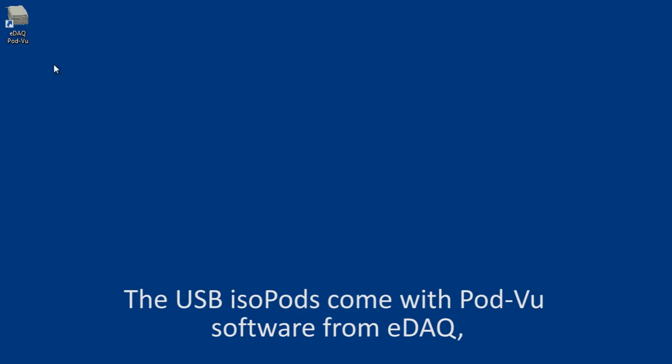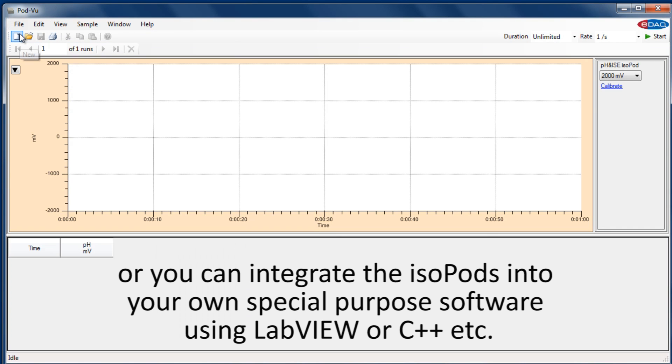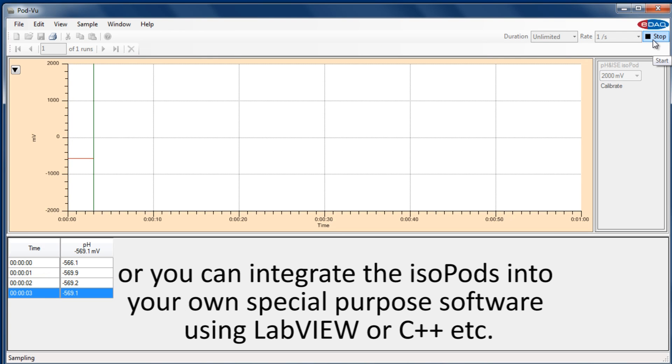USB isopods come with Pod View software from EDAC, or you can integrate the isopods into your own special purpose software using LabVIEW, C++, and more.